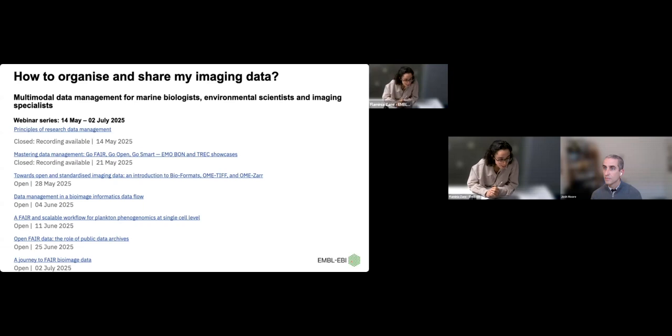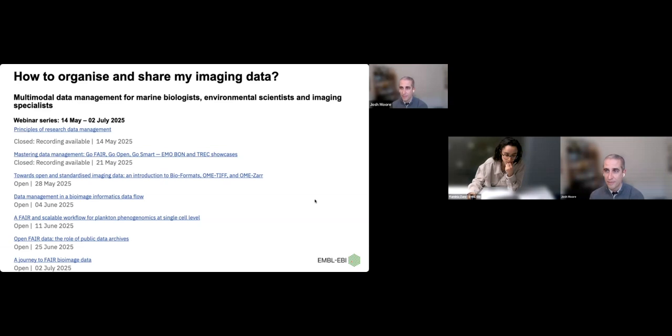Thank you. The next question is about metadata. It's a little bit more structured, but if I understand it correctly, someone is saying the microscope metadata might not be sufficient. For instance, there may not be information about which channel represents what biological structure. So do you recommend including those experimental details as sample metadata in the image metadata when storing the image online? Yeah, I'm very much in favor.